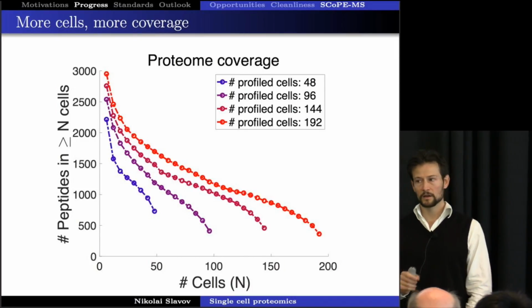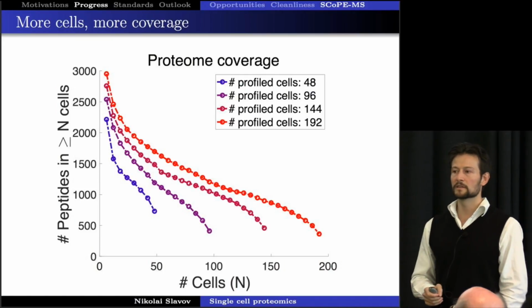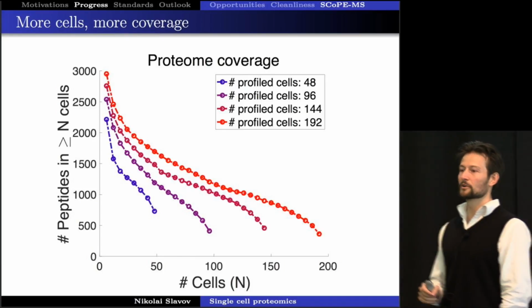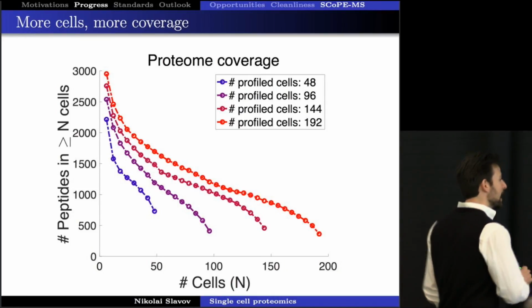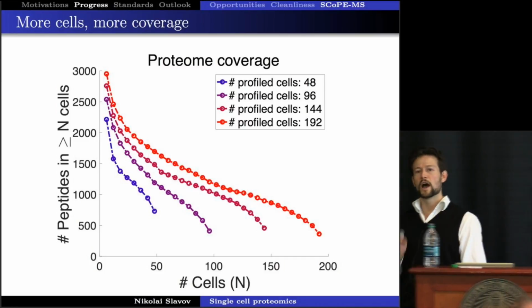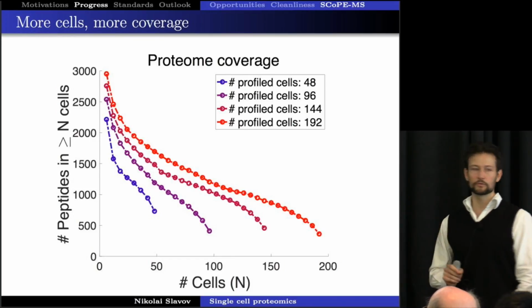And this data are at less than 1% false discovery rate. It is posterior error probability, for the aficionados, less than 10 to the negative 2. And only using the spectra. But why should we be using only the spectra? I showed you that our chromatography is remarkably consistent. And that would be an informative feature to use.